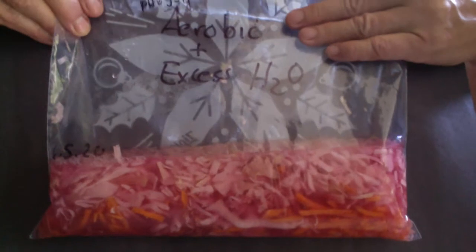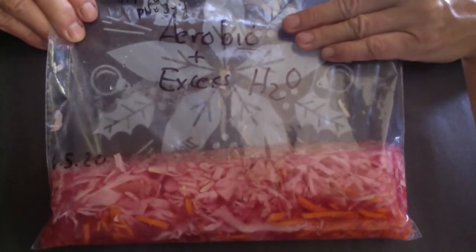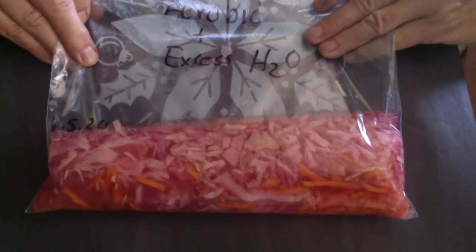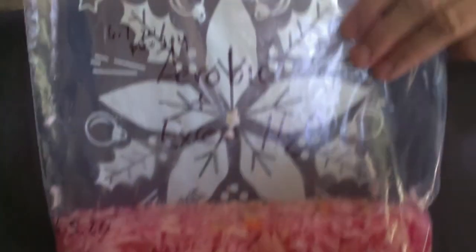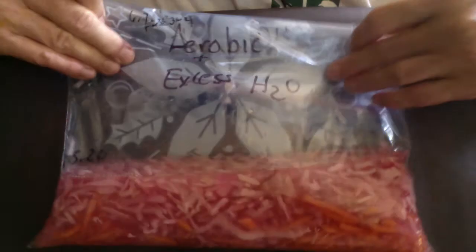The third aerobic condition was when we added excess water to the cabbage with no salt. This was testing to see if just an anaerobic environment — which the excess water would create — would help preserve the cabbage. You can see that it's looking really nice. There's some darkish discoloration going on, but it looks much better than the negative control. And again, it smells like there's lactic acid fermentation going on there. So that's really neat.